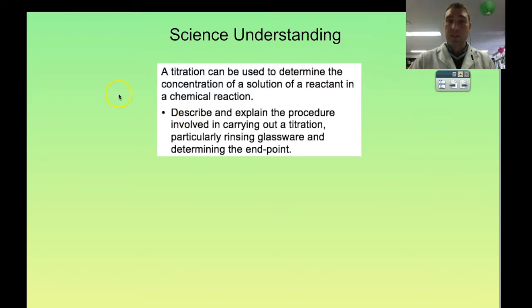So the science and understanding we're going to look at: a titration can be used to determine the concentration of a solution of a reactant in a chemical reaction. We're going to describe and explain the procedure involved in carrying out a titration, particularly rinsing glassware and determining endpoint. So let's go to a video of doing that.